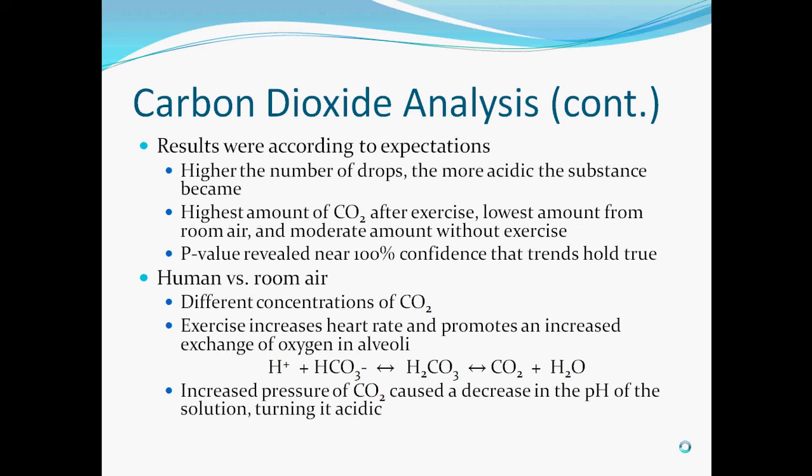So the originally pink solution turned clear more quickly. The equation of this reaction is shown below. The theory is that an increase in the pressure of carbon dioxide will cause a decrease in pH and therefore make the solution more acidic.